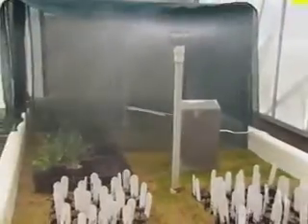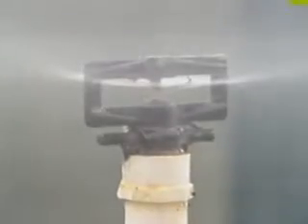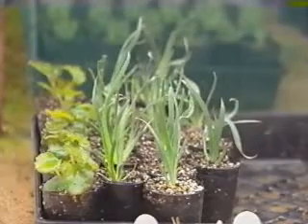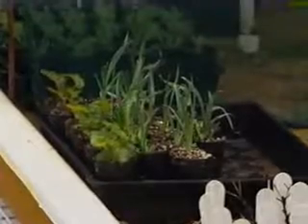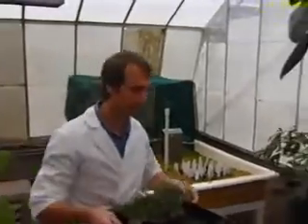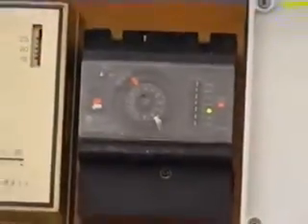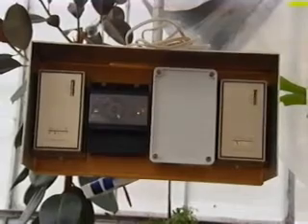To reduce light, a shade cloth can be used. Shade cloth comes in various densities. Up to 70% of the light may need to be eliminated in the first few days. Gradually, the light intensity is increased and the humidity is decreased until such time the plants have developed functional roots. The temperature in the glasshouse should be maintained as close as possible to that of the growth room, where the plantlets come from.